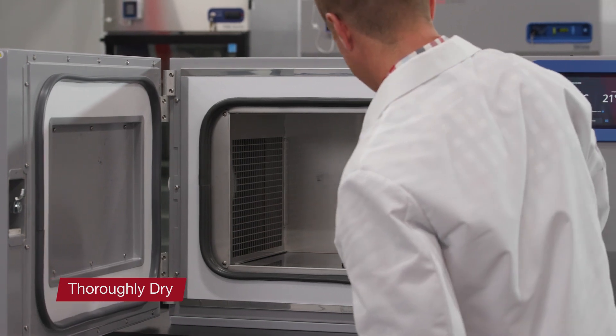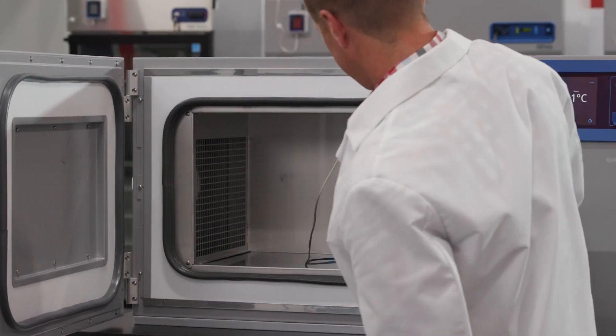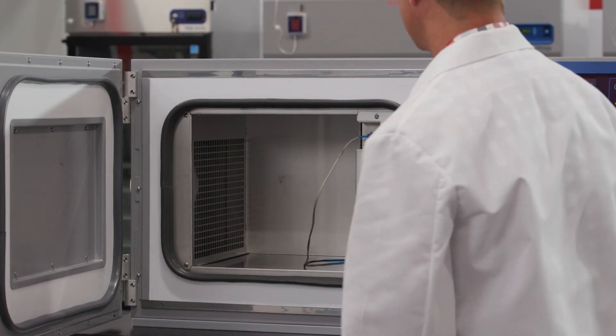Thoroughly dry the door and chamber opening gaskets and heat breaks after each run using a soft cloth to prevent ice buildup, which could reduce the effectiveness of the door seal. Immediately clean up any water that may drip onto the floor in order to prevent potential slipping hazards.